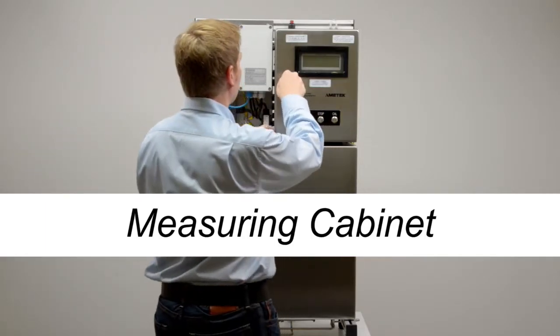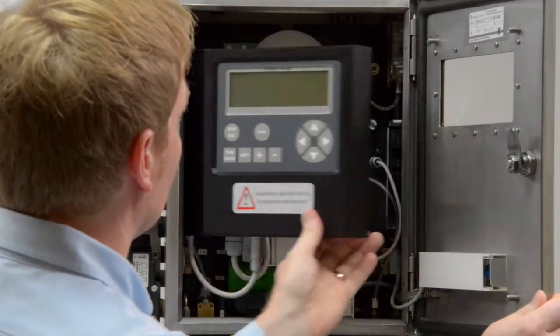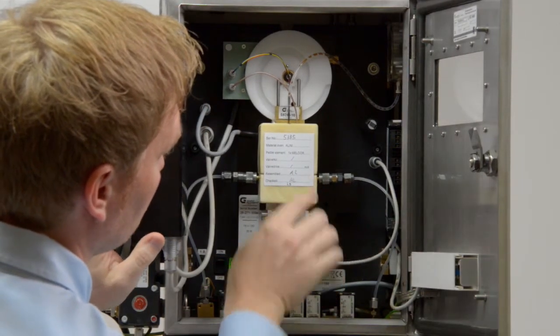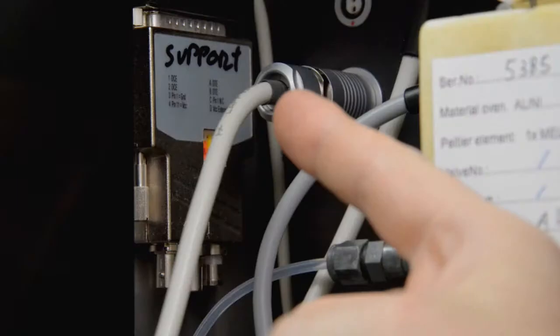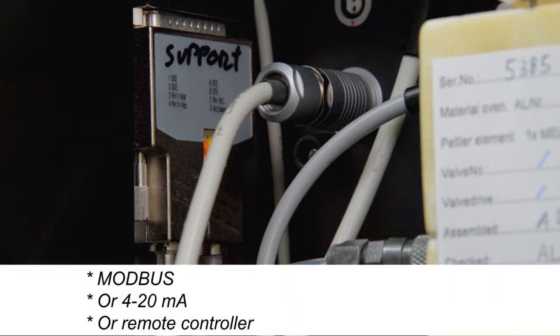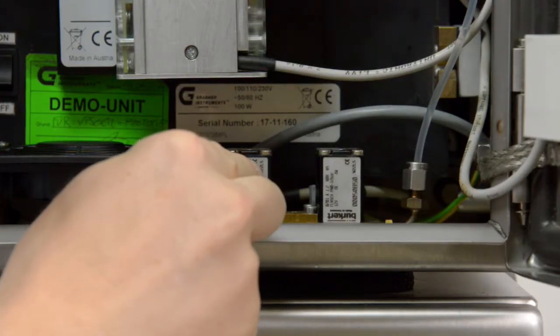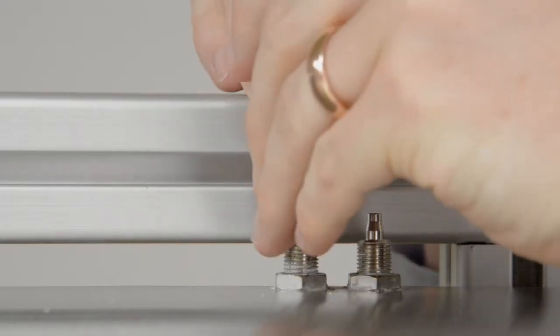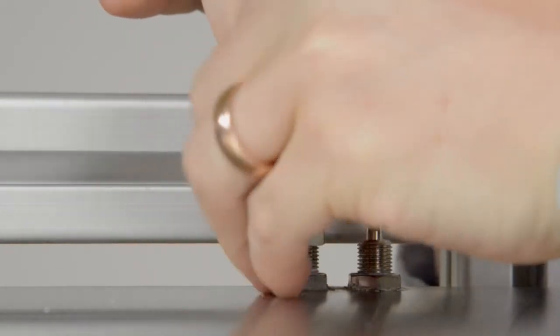Measuring Cabinet. The measuring cabinet contains the controller, the measuring cell with an integrated shaker, the automatic oiler, the communication port with an RS-232 interface for Modbus data transfer. Other available communication options are a 4-20 mA converter for analog data transfer or the remote controller for monitoring the analyzer from a non-hazardous area. The measuring cabinet contains two valves for different sample streams and one for the calibration fluid. External water cooling can be attached to the top of the cabinet for additional cooling of the system.